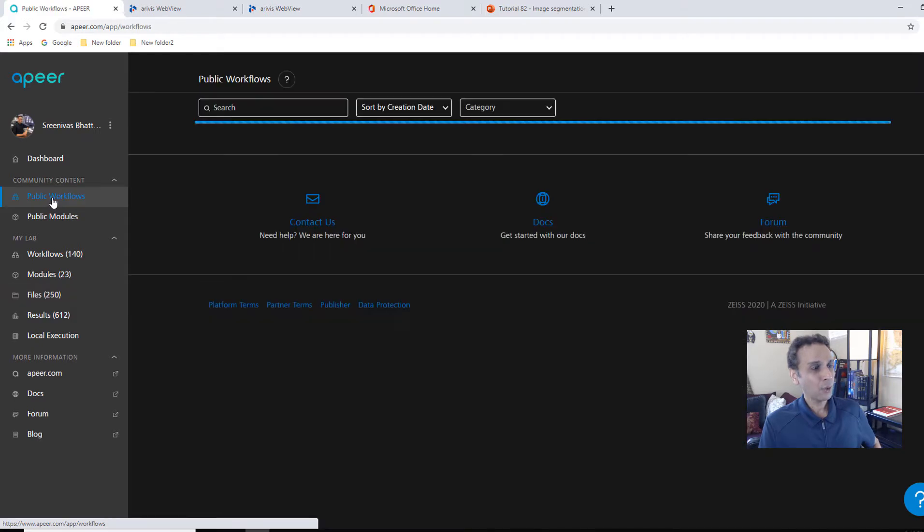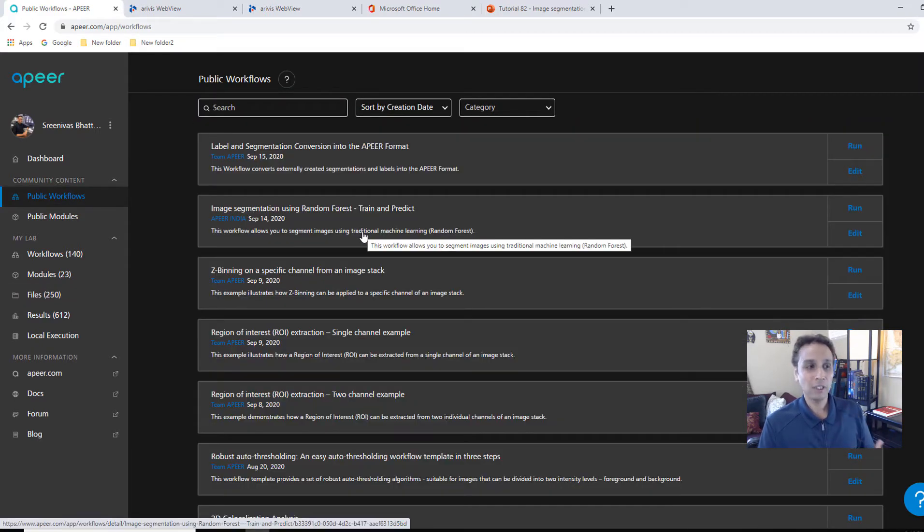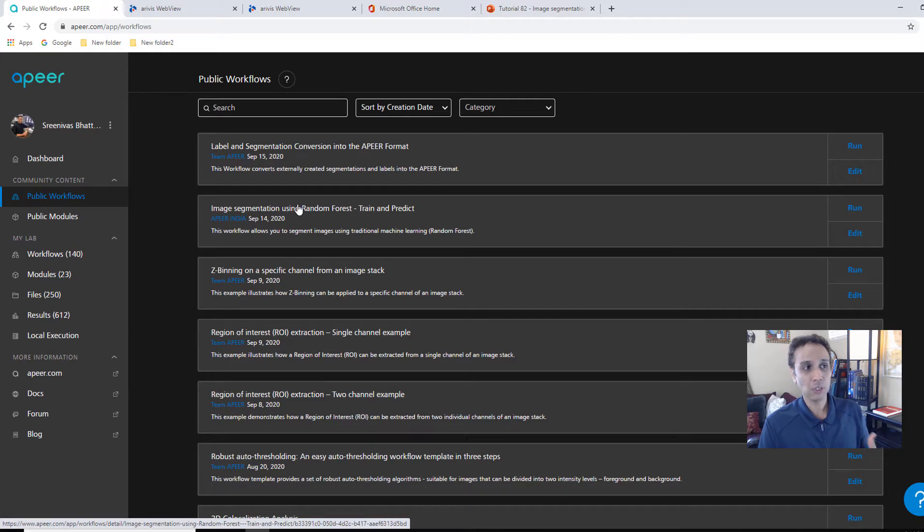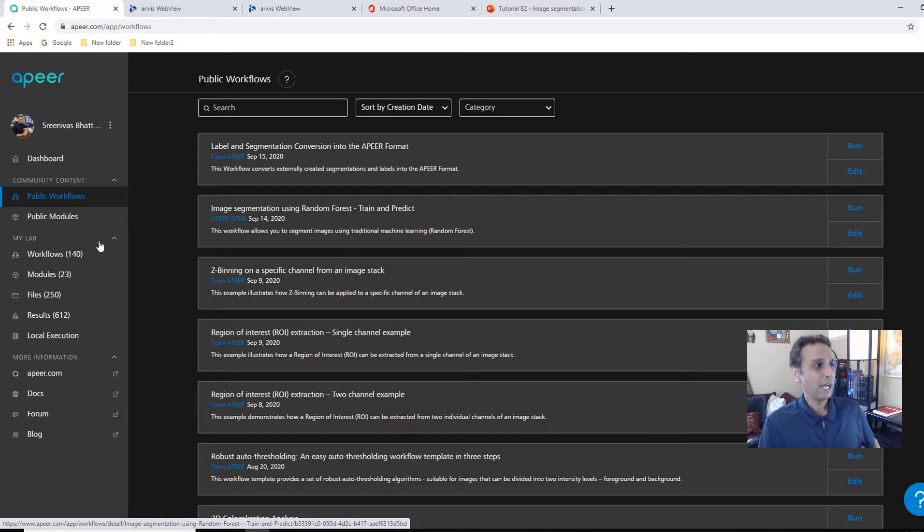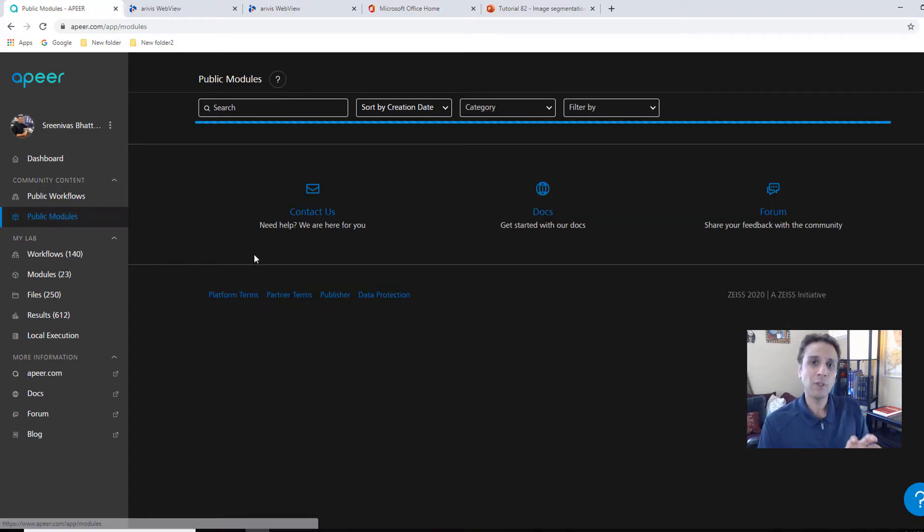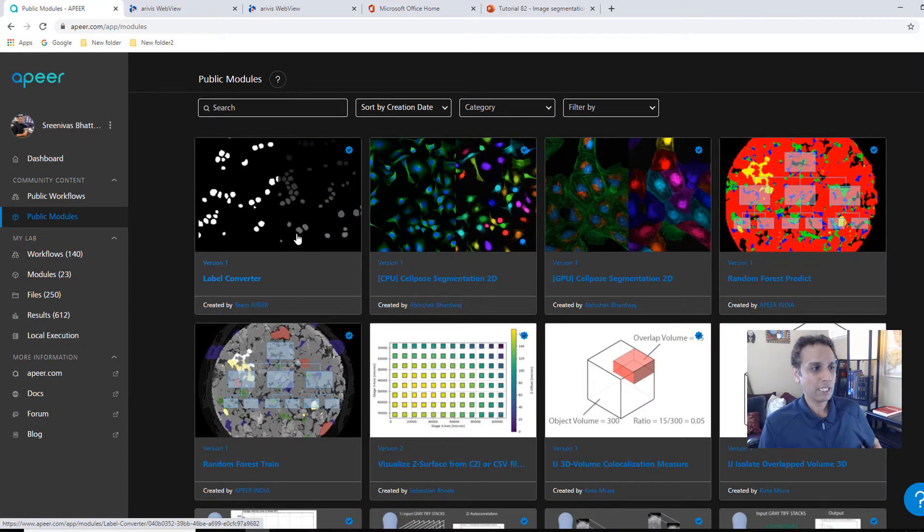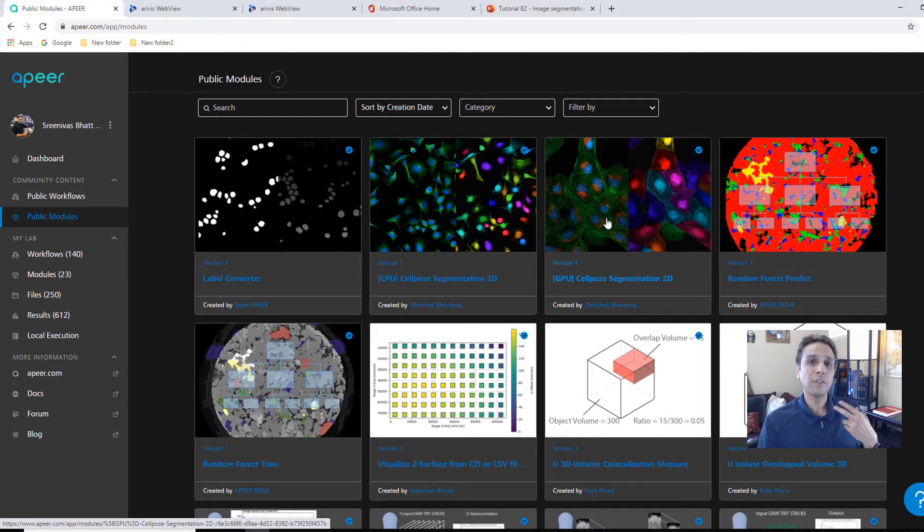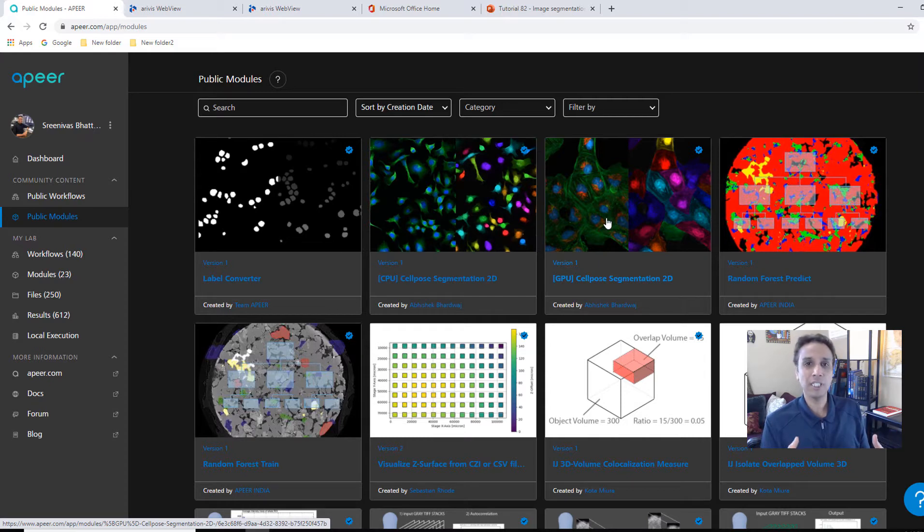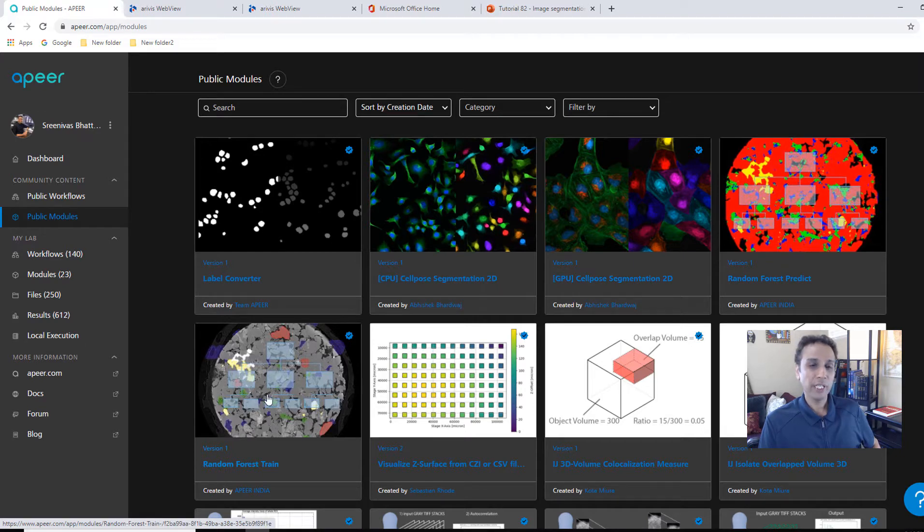You can share those. You can send the links so others can just visualize your images, interact with your images. You can download them. You can visualize them. You can annotate them. We'll see annotation part in a second. And public workflows are the workflows that APEER team put together or someone else actually put together. There is one that's called image segmentation using random forest, and this is the one we will be using today. Public modules are individual modules. A workflow is where you put the modules together into a meaningful form.